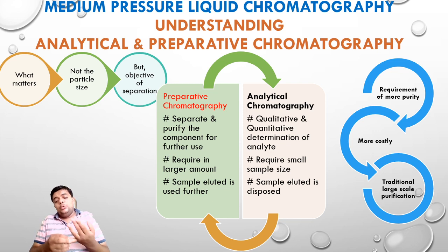And when this accuracy, precision, and purity comes into existence, definitely preparative chromatography holds a better position compared to the traditional large scale purification methods. So, whenever we are talking of purification, always prefer preparative chromatography over other methods.